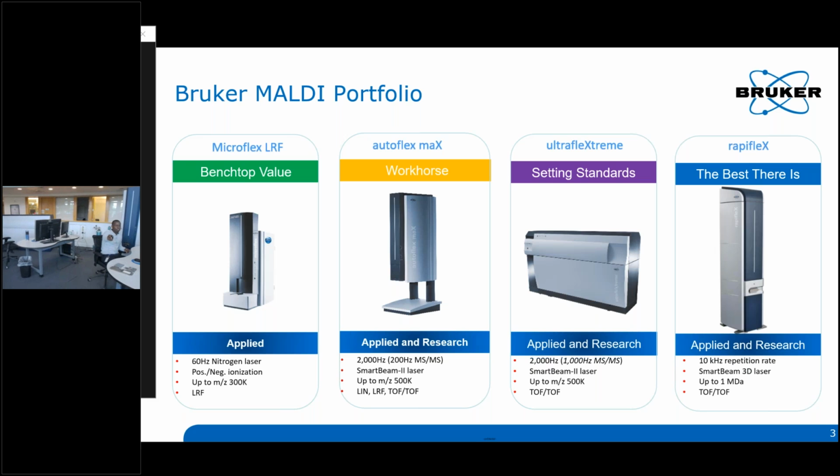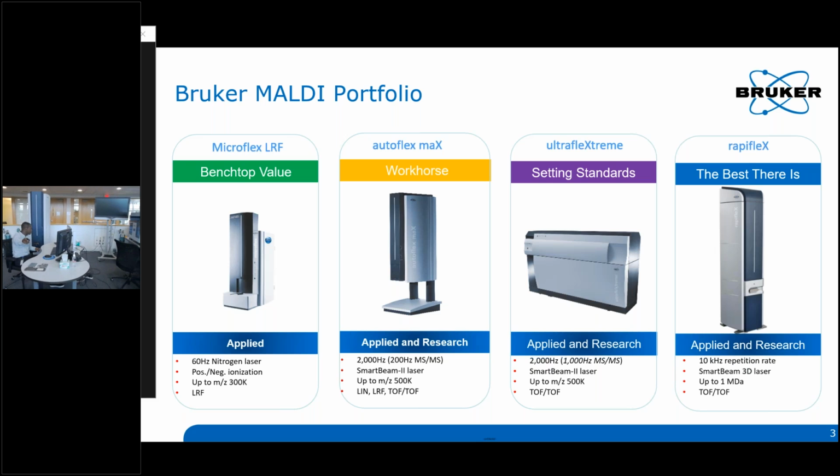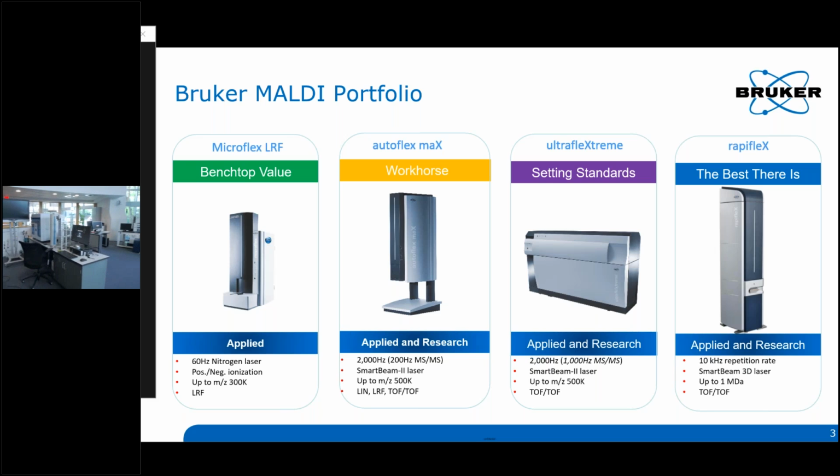And then in front of me, the camera is a bit slow, but we'll get there. We have that tall standing Rapiflex, which is just coming into view. And then next to it, there are a few other instruments, so the timsTOF Flex and the timsTOF Pro and a few other LC ESI TOF instruments.